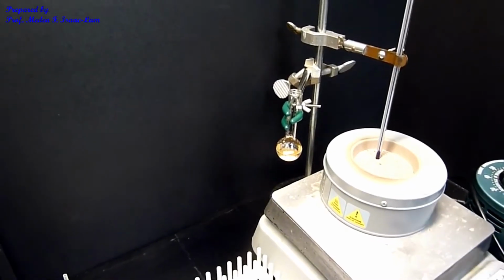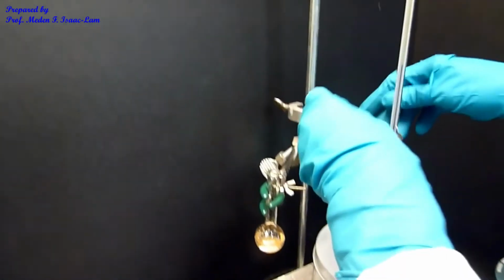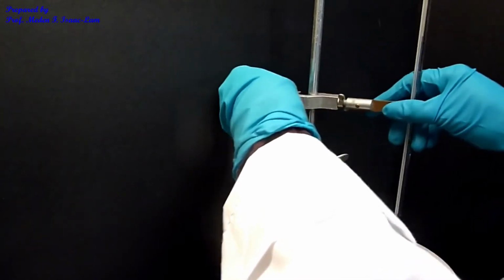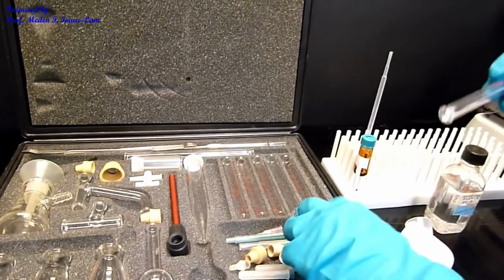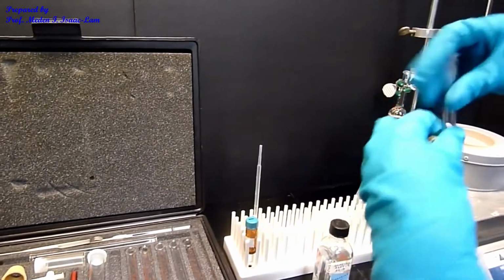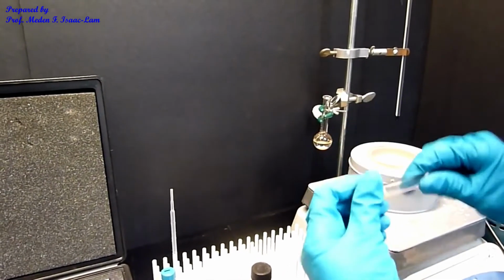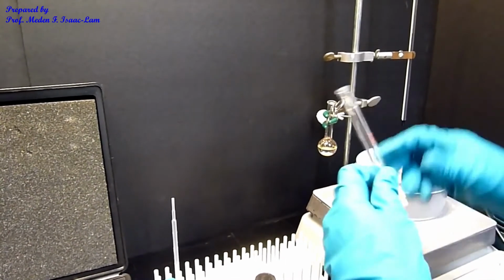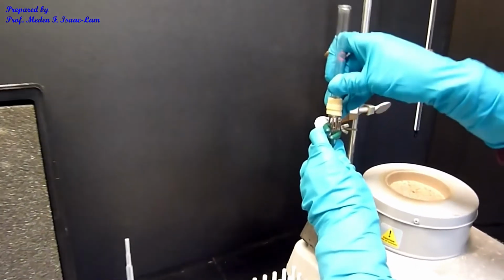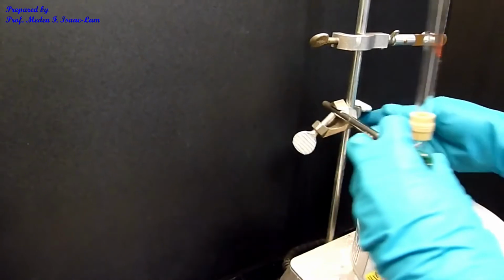So the temperature right now is close to 148, 147. So I think we're ready to reflux. And I'm going to put it out. And then I'm going to take out from the micro kit this air condenser. And I'm going to use the adapter. So it should snap, and then I'm also going to snap the top. Okay, so then I'm going to now reflux it.